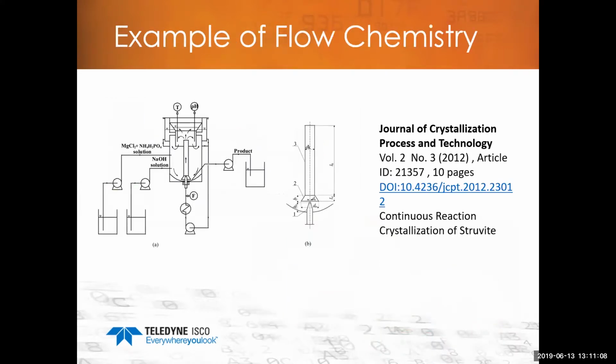Here is something that's actually from an article in the Journal of Crystallization Process and Technology, that refers to the continuous reaction crystallization of struvite. On the left you'll see two little pump markings just above the two lower vats.